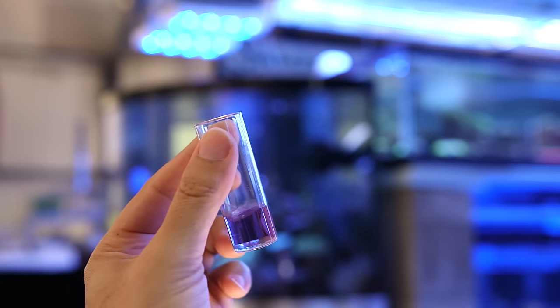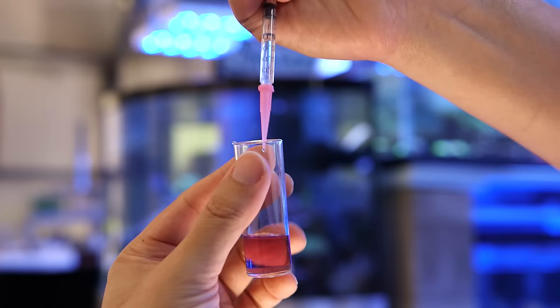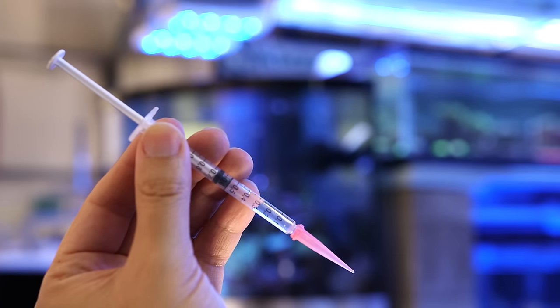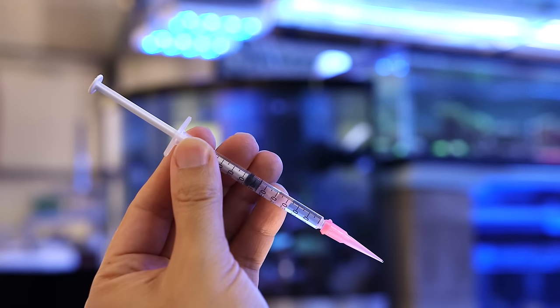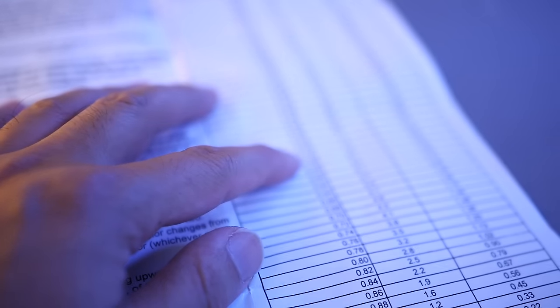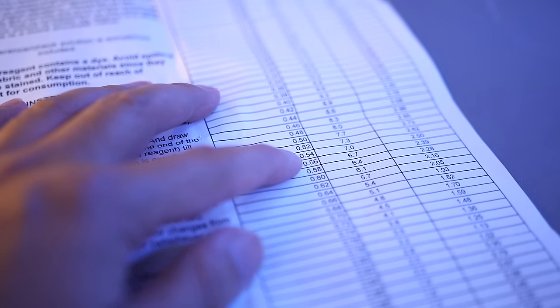And there's our color change. Now to determine what the alkalinity level is, take a look at the syringe and see that the end of the stopper is now at the 0.55mL mark. So we've put in 0.45mL into the sample before the color change. Referring to the instructions, we can see that the reading of 0.55 means that the DKH reading is somewhere between 6.7 and 7.0. That's a little low considering that natural seawater is a bit over 8.0.